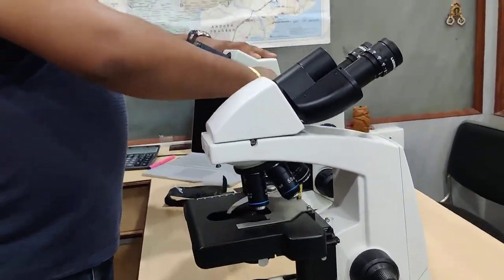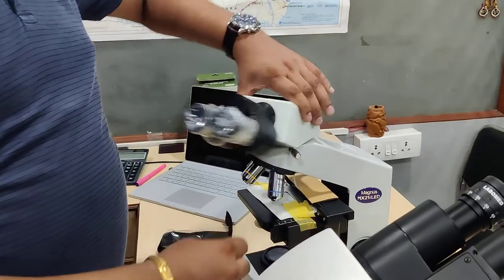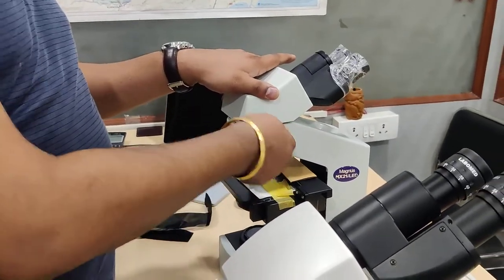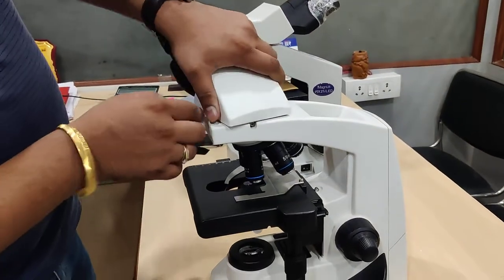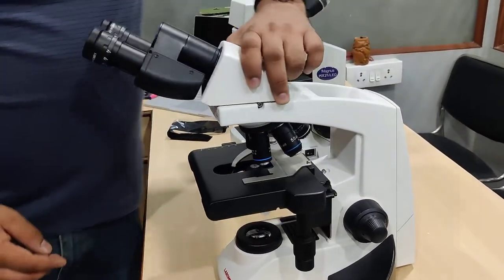In the MX-21i, you get a screw to rotate and tighten the head. Whereas in the Labomid, the movement is on hinges and you get free 360 degree rotation.